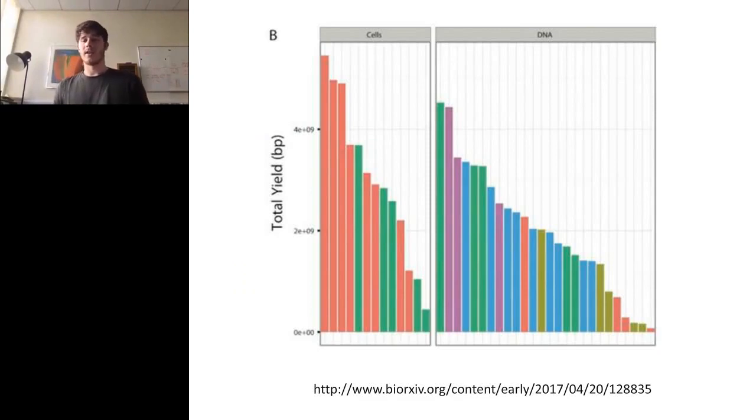Another unique feature of nanopore sequencing is that it reads whole molecules, which means instead of reading short defined lengths of DNA, which is how many previous technologies would have worked, it can read whole long fragments of DNA, and really it depends. It can really read anything that you can manage to get into the actual device.